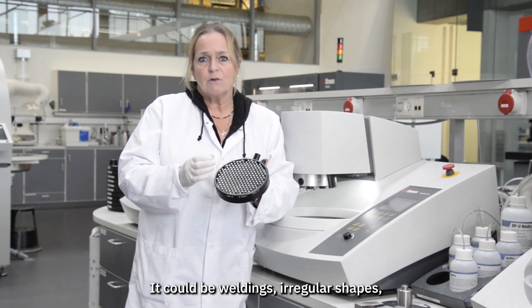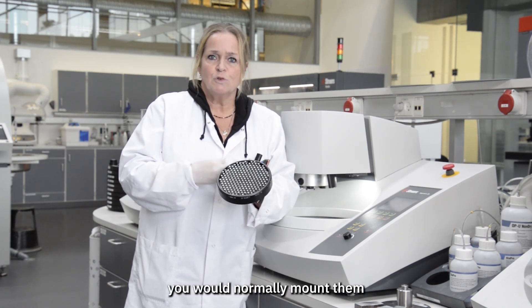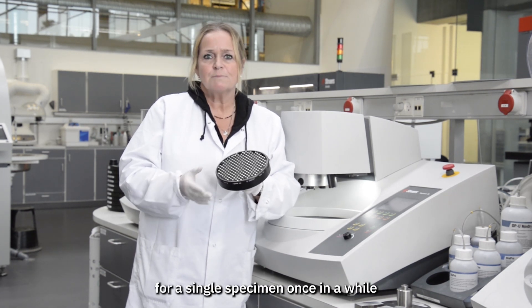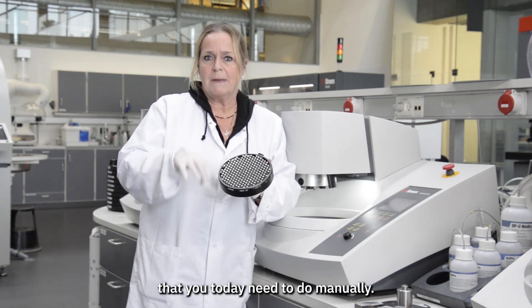It could be weldings or irregular shapes that cannot be fixed in a holder. If you have very small samples, you can normally mount them and we have holders for that. So this will replace the holder for a single specimen that occasionally comes into the lab and that you today need to do manually.